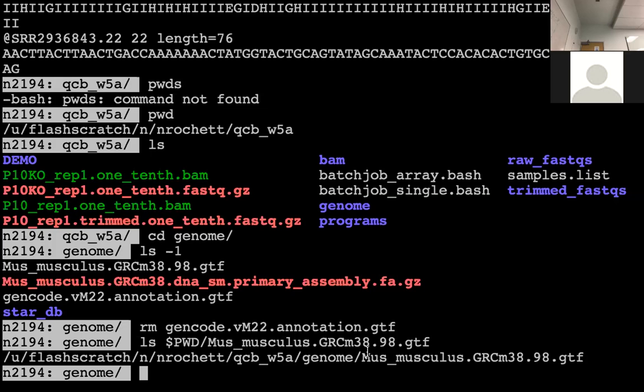Some languages will have this variable with this asterisk. Instead, it just replaces it with asterisk letters, as if it was an empty variable. Okay. So when you do this, then you don't have the actual... You don't have the actual... So if we remove the $, and now if I do this, then it works. This is P10. Okay. I'm just checking that things are set up.